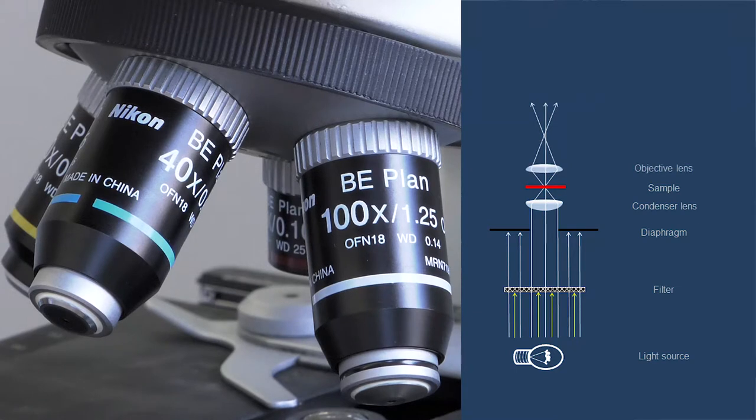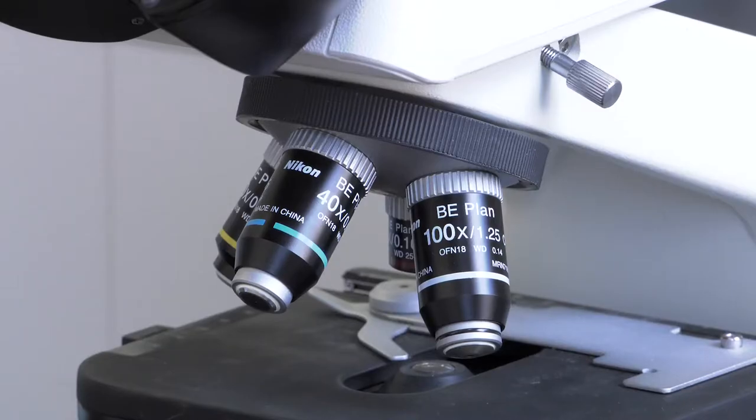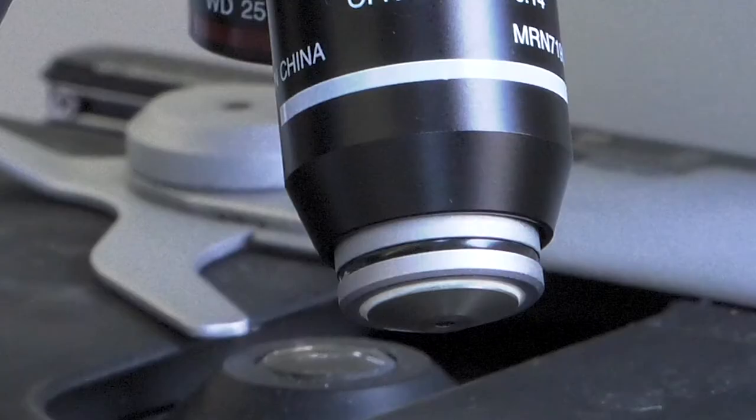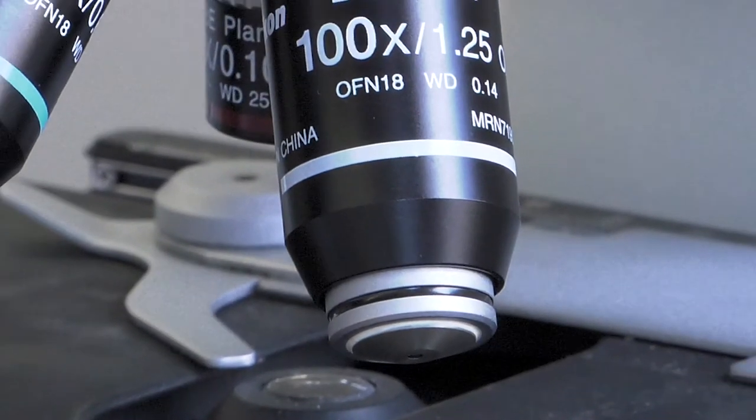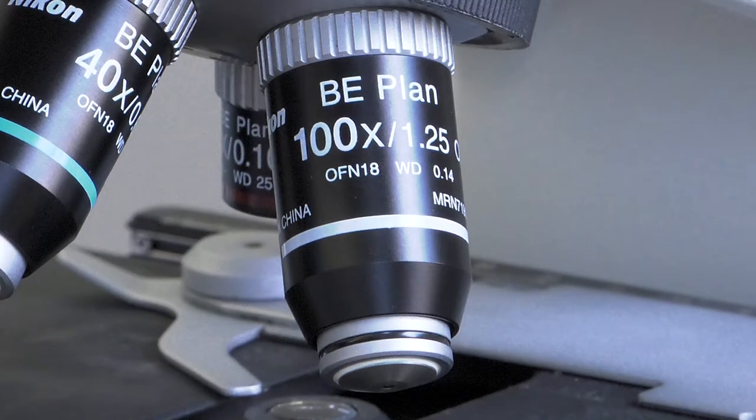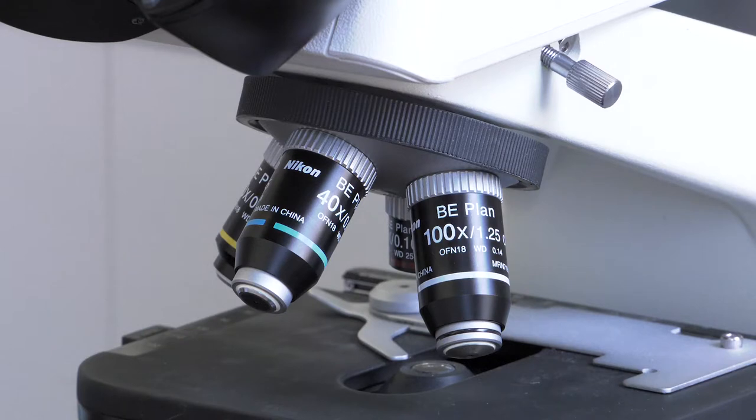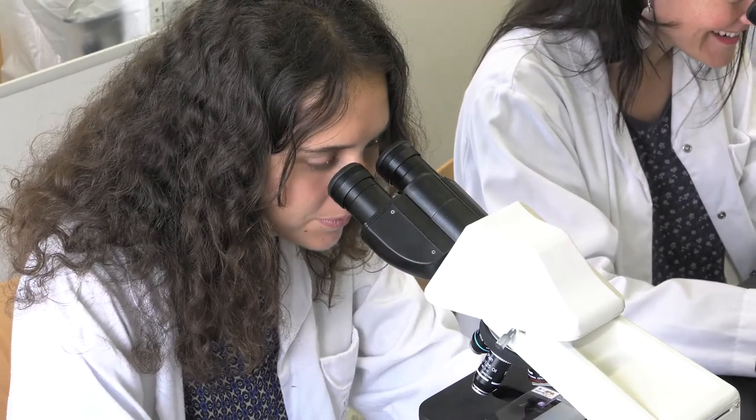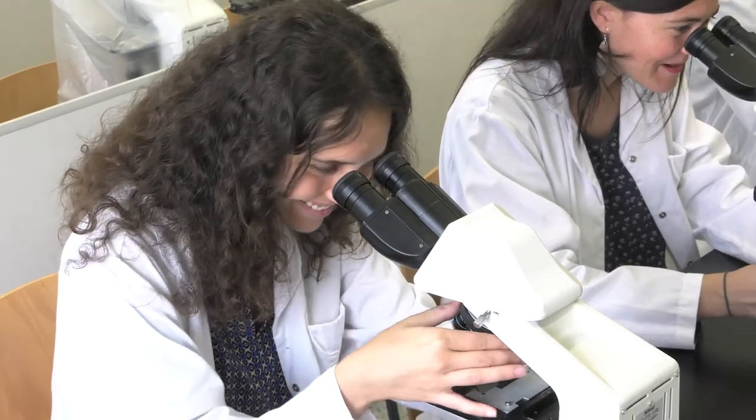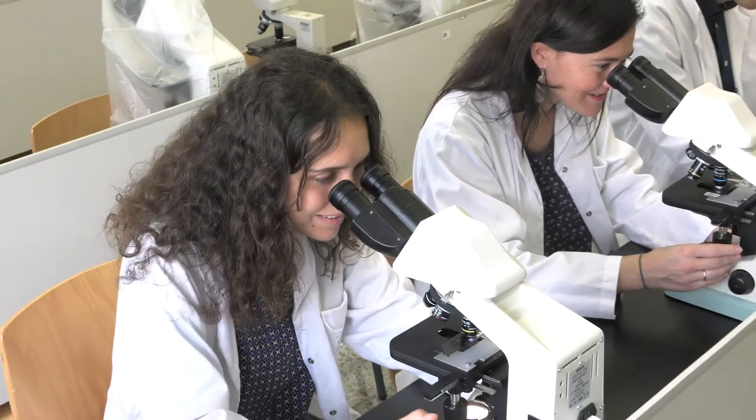The image then reaches the second lens, also known as objective lens. The microscope has many objective lenses. Each one is included in a dark, cylindrical chamber, called tube. All of them are included in a piece of the microscope, called nose piece, which is able to rotate manually in order to select the most adequate lens for each observation.